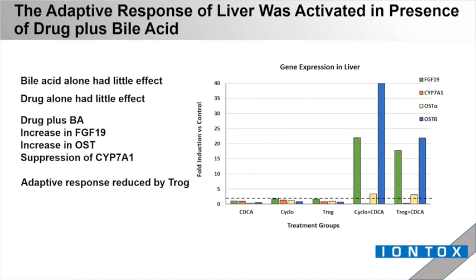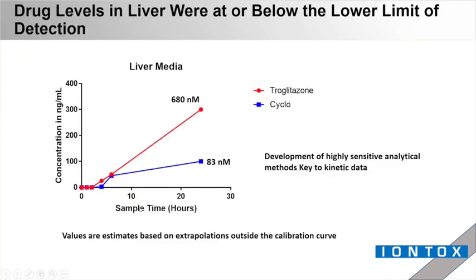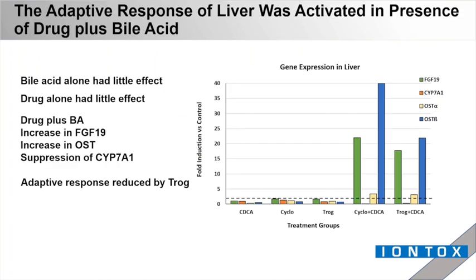And so we're seeing clear effects of this at really low concentrations. If you remember here, we're looking at nanomolar concentrations. And this could be significant for risk assessment of pharmaceuticals, because we're observing these responses at concentrations much lower than those observed when you're just adding drugs into a liver compartment in a typical in vitro study.